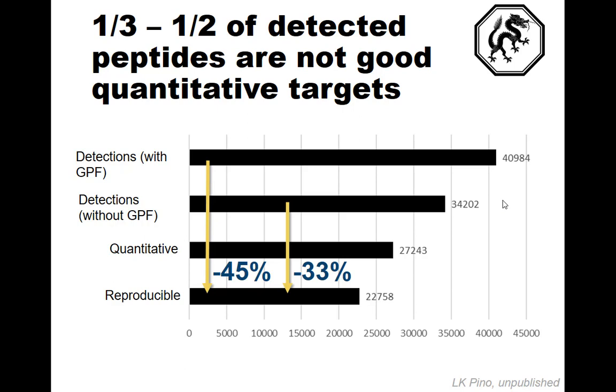Yeah. So I don't think I have the slide in here, but looking at the distribution of the data, I do not see a U-shaped curve, but I'm also using some of these peak boundary tools that are being developed by Brian and other members in the lab, right? So this is pretty unusual for me to see an instance where the boundaries over which I'm integrating start including transitions that are not there. More often, I actually see the background values going to zero.